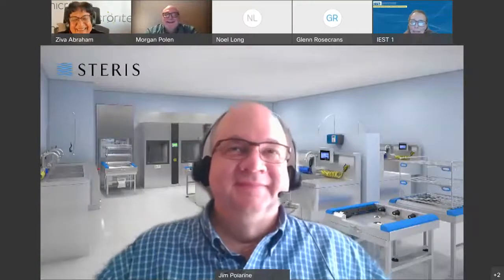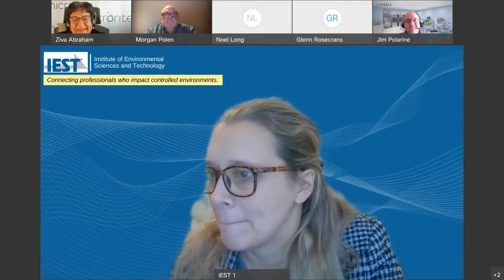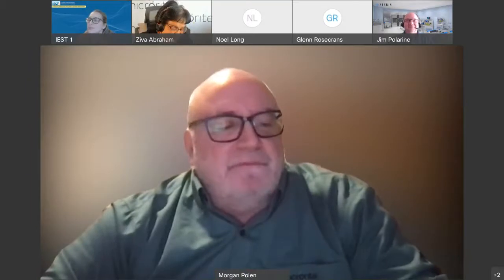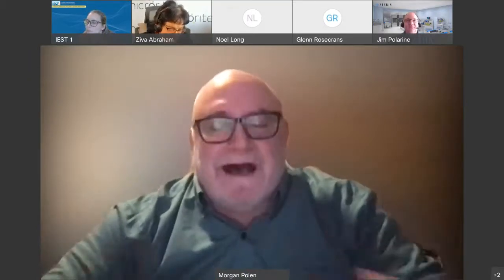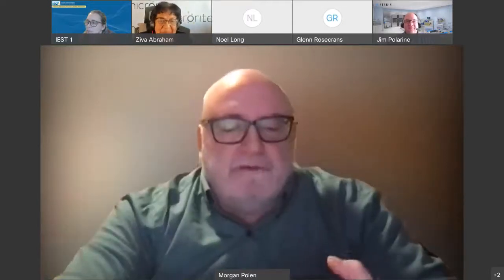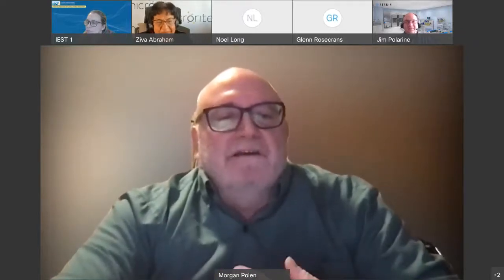So let's say the FDA comes into your clean room and they make a comment about rust. Why? Morgan. Yeah, it means you're probably using bleach. Facilities that we get involved with that have issues with fungal contamination, one of the common symptoms we see is the floors degraded, and you see rust on areas.